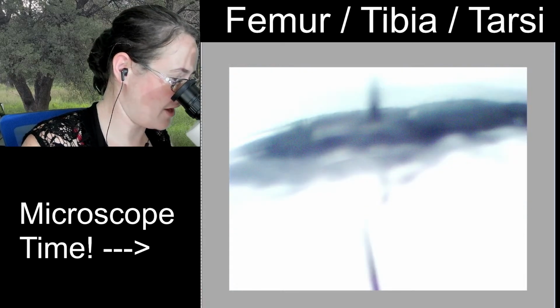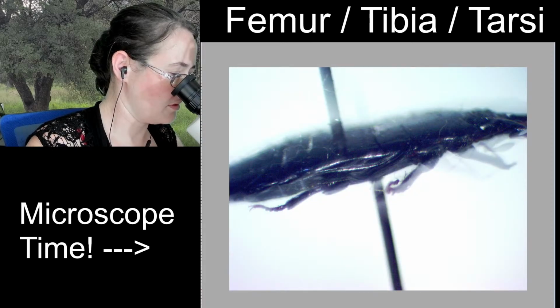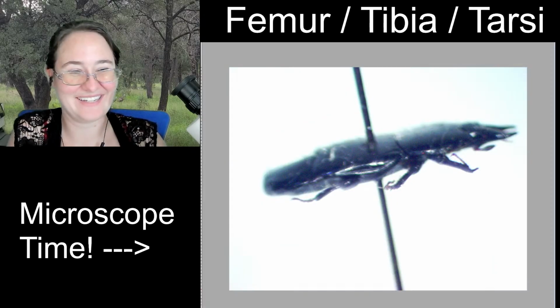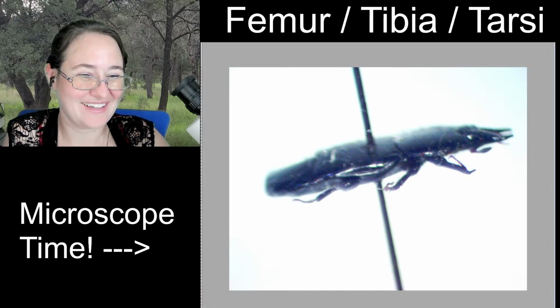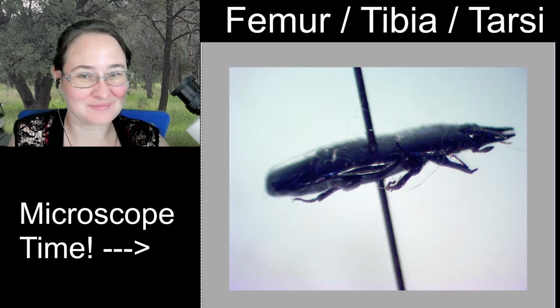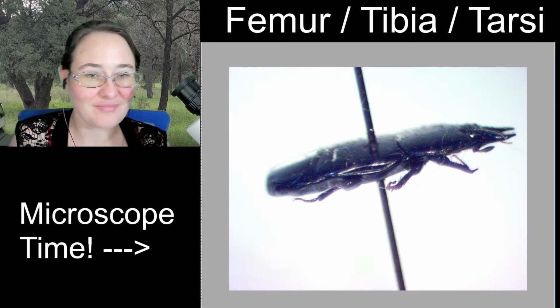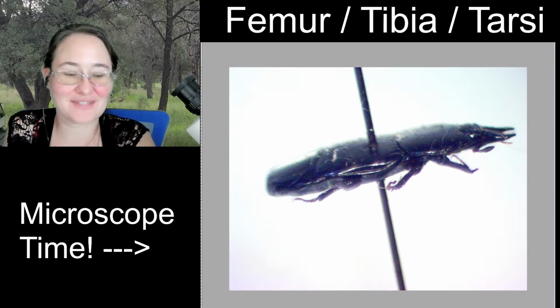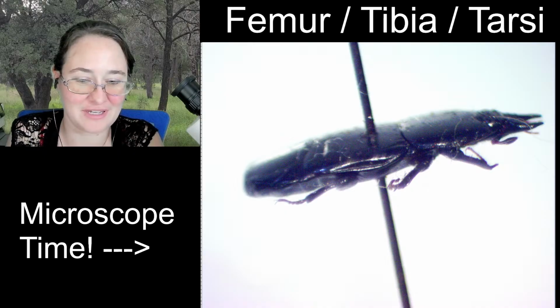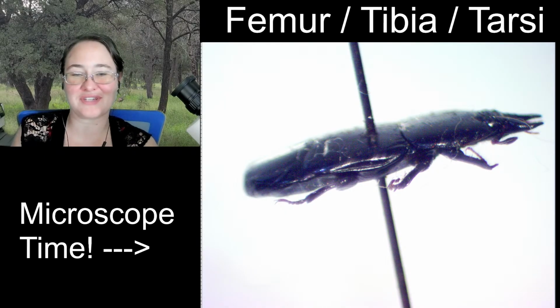That's perfectly lateral. This is how incredibly flat this beetle is. 0.16 centimeters.